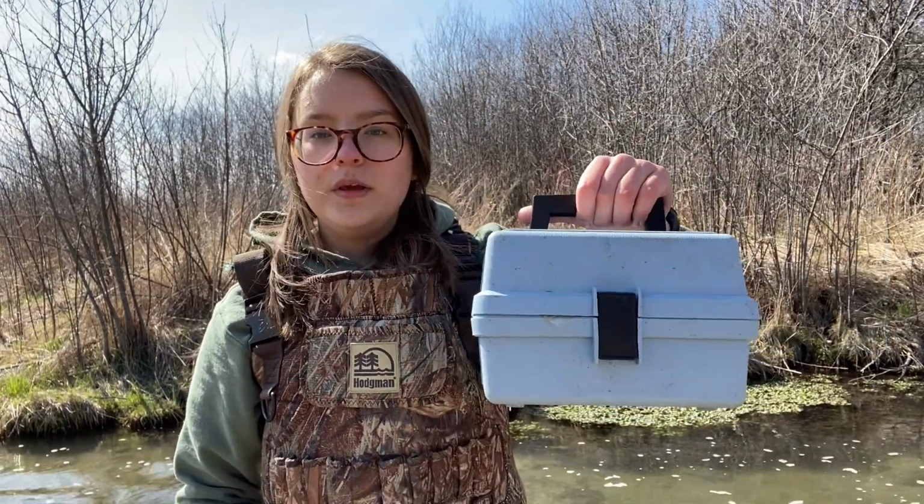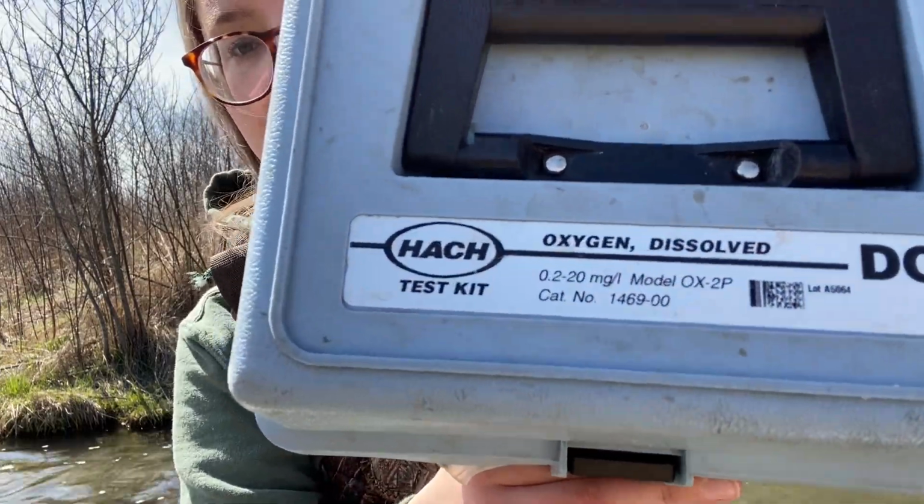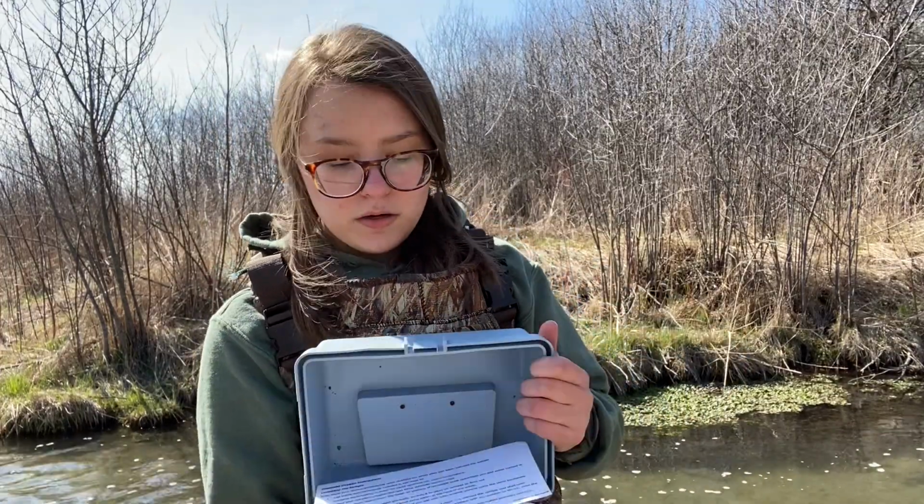For our program, we use a Hach kit. A Hach kit is a dissolved oxygen kit, and inside it we have a couple different chemicals to help us determine how much oxygen is in the water.